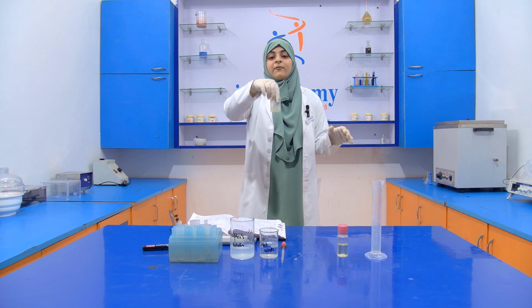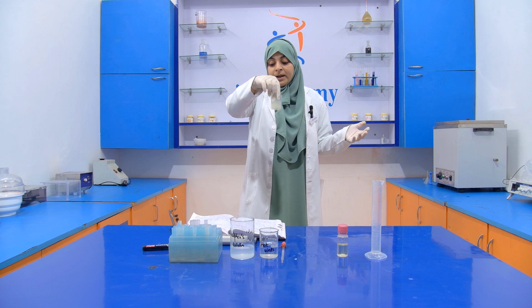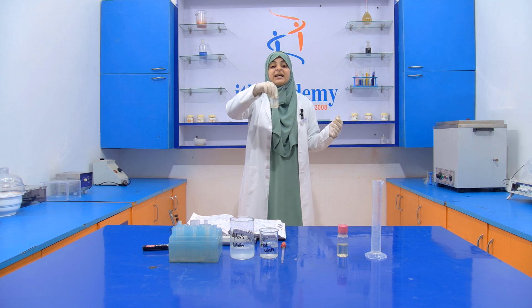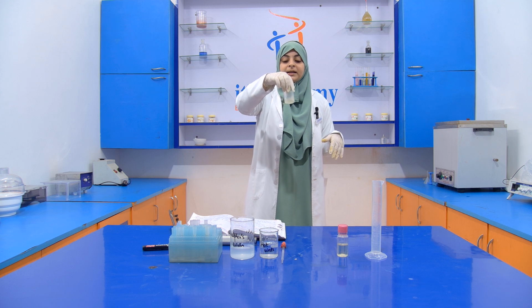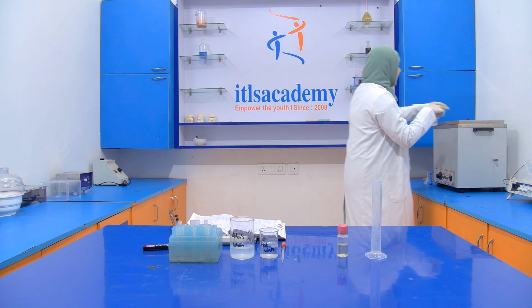Then again we keep it in the oil bath or a brine bath for 2.5 hours. So we will see the result after 2.5 hours, whether the color appears or not. Now I am going to keep it inside the water bath.